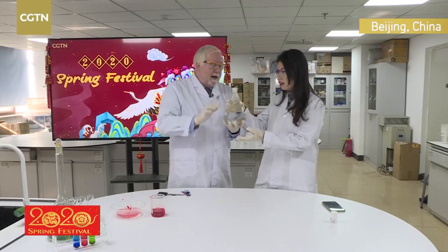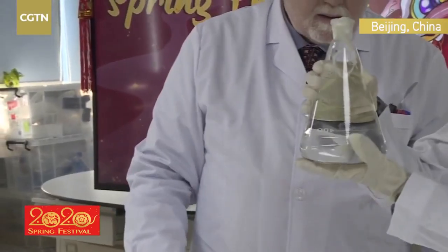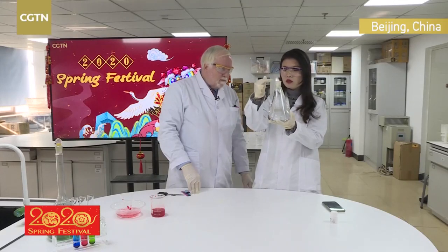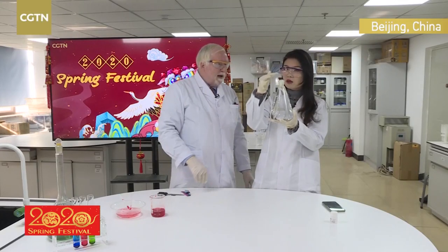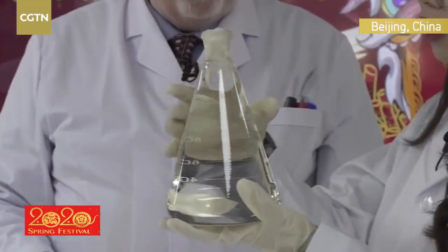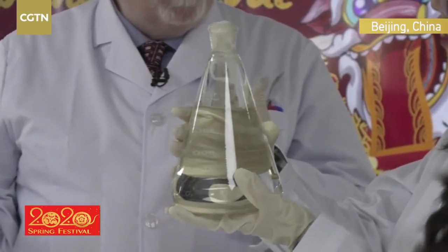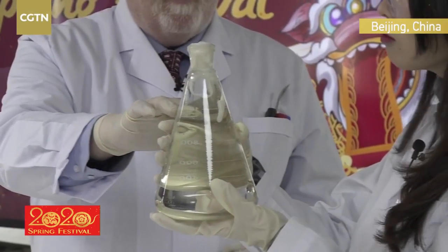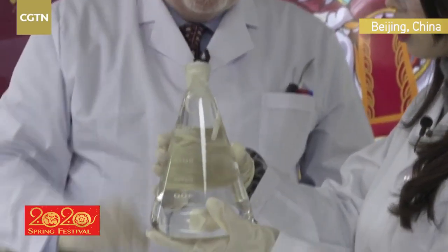So this antacid will now actually... This is the reaction you want. So if you eat too much and you take the drug, it creates a line there, right? That's right. You get a nice little plug which stops the acid from refluxing up. Okay, got it. So it's two very simple chemical reactions. So one to make the CO2 and the second to make the calcium alginate plug.